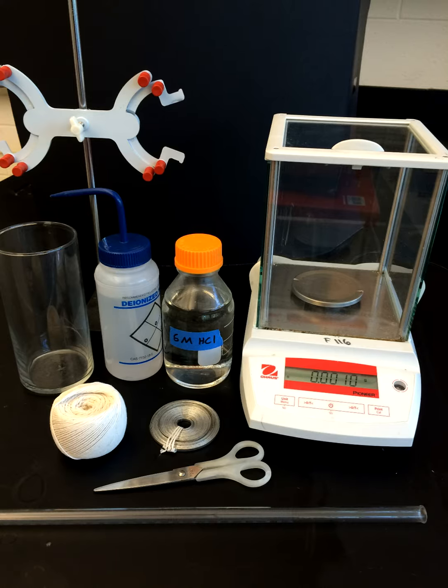In this lab, we will be determining the R value in the ideal gas equation. Here's some of the equipment that will be used in this experiment. The eudiometer is a device that allows us to collect gas and measure its volume.